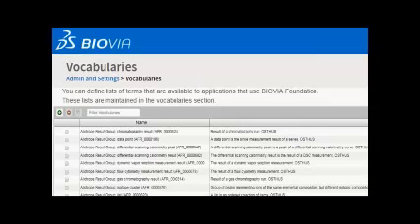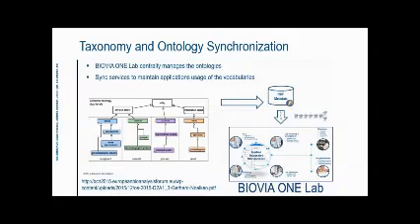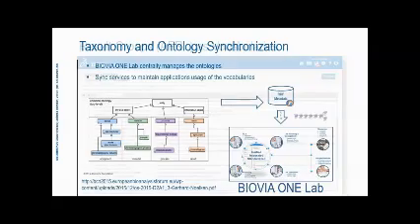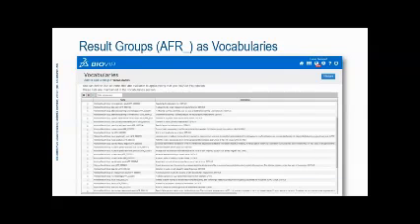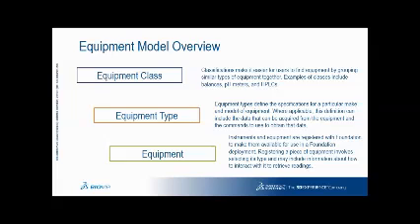Now, all we've really done is taken a file, processed it, pulled it into One Lab. We still don't really have a lot of value yet. What we now need to be able to do is put some things on top of that. And so if I take that and look at it in the system, we have vocabularies to define all the equipment. We have the vocabularies to define all of the readings and so forth. And again, what does that mean in the grand scheme of things from a lab standpoint? Not really anything yet.